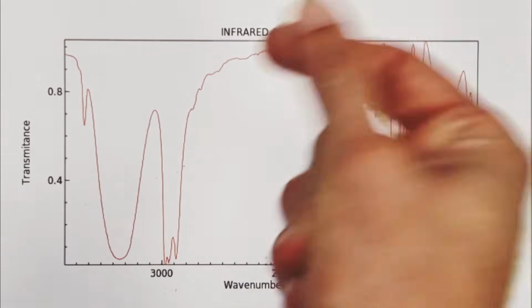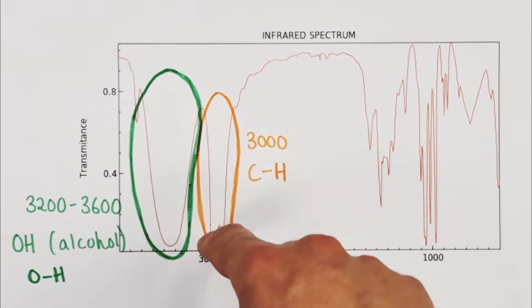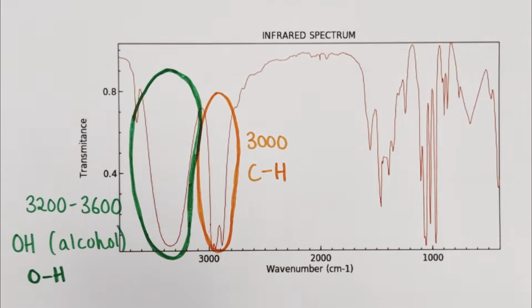Well, when we go to the data booklet, we find some useful information. The trough is centered around 3,300, 3,400. Therefore, we're talking about a range of 3,200 to 3,600, and that is indicative of the IR radiation absorption and vibrations linked to OH bonds found in alcohols. And it's clearly a different place to those found in carboxylic acids, which would have been more over here. And this division of space is a nice way of identifying that this is an OH group found in alcohols, not an OH group found in carboxylic acids.